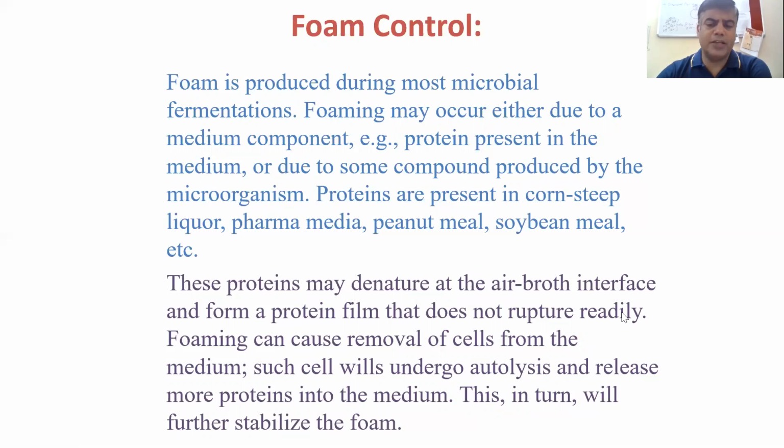This protein may denature at the air-broth interface and form a protein film that does not rupture readily. Foaming can cause removal of cells from the media. Such cells will undergo autolysis and release more protein into the media. So there is foam formation, which in turn further stabilizes the foam.